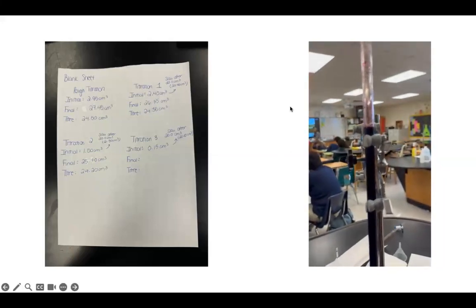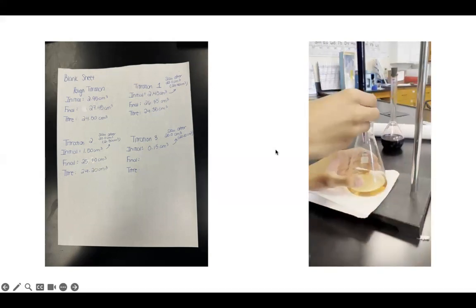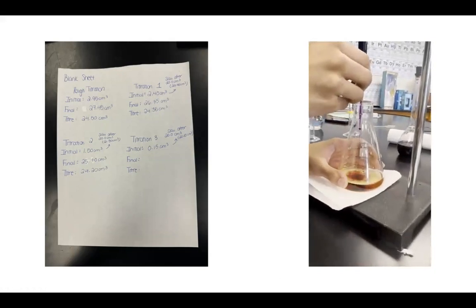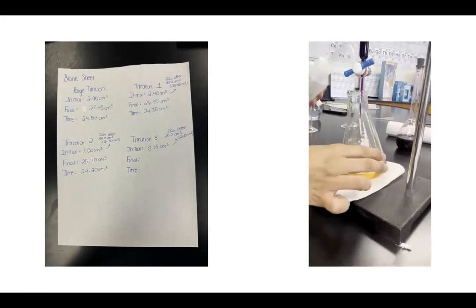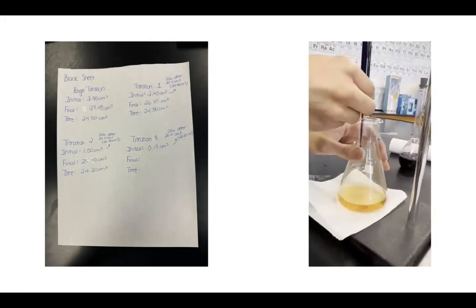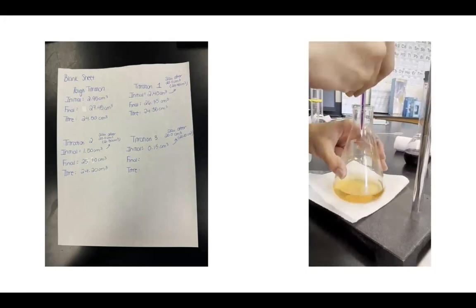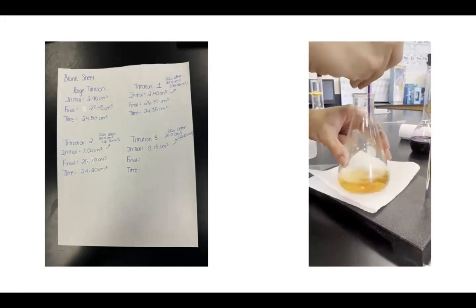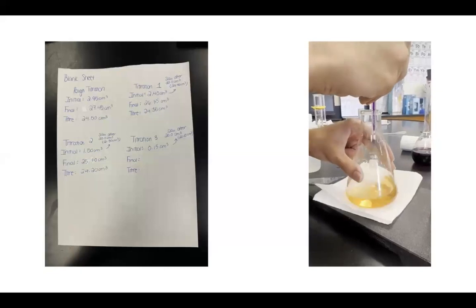So after we reach 20, we can start going drop by drop. That was not very drop by drop, but now we are, okay. Again, remember to use distilled water to make sure all of FA2 that is added is in the solution, not just onto the walls of the flask. Stirring constantly. I'm looking for at least a 30-second color change.